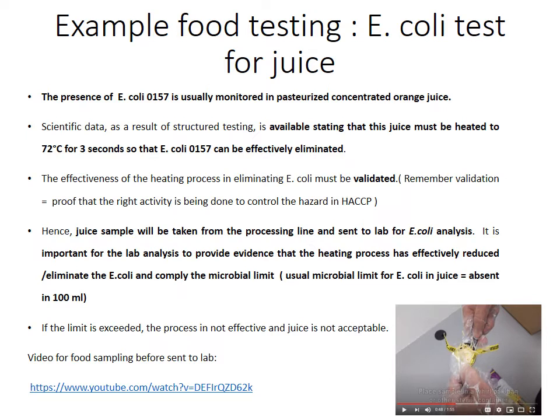If the limit is exceeded, the process is not effective and the juice will not be acceptable, so the whole production will be stopped and investigation will be carried out. Okay.